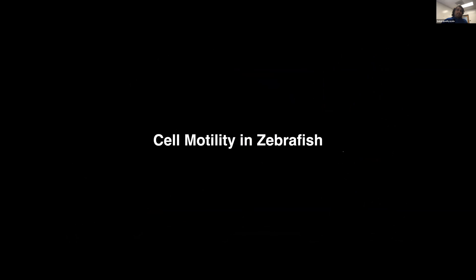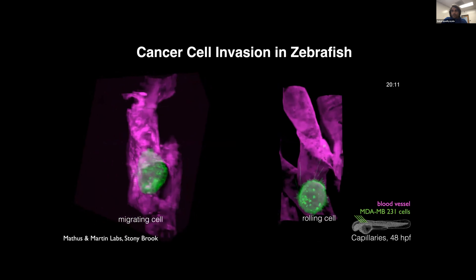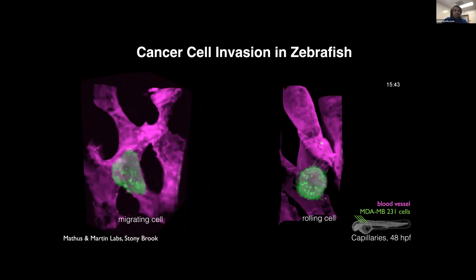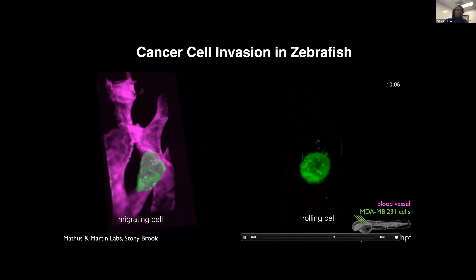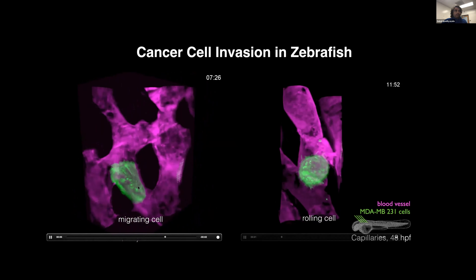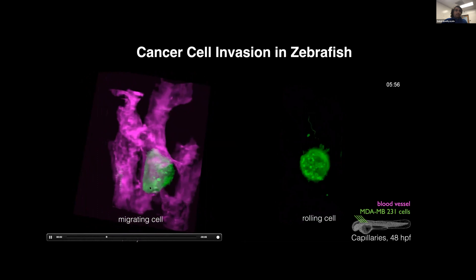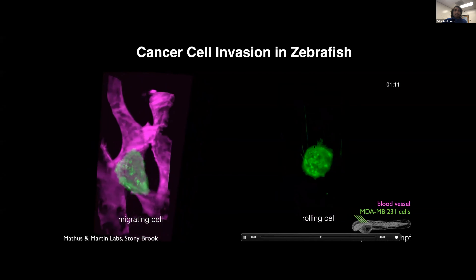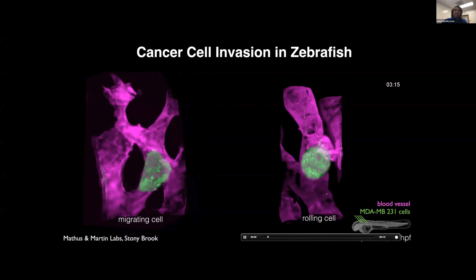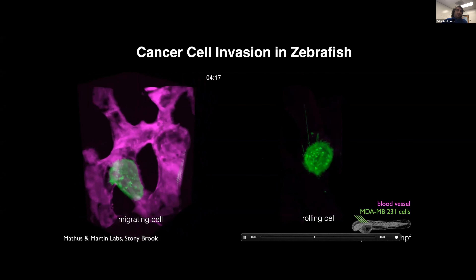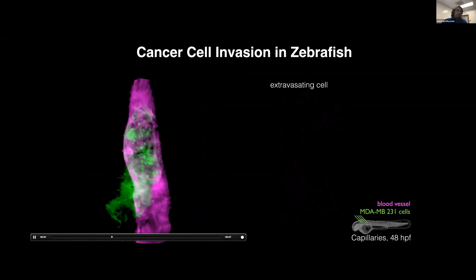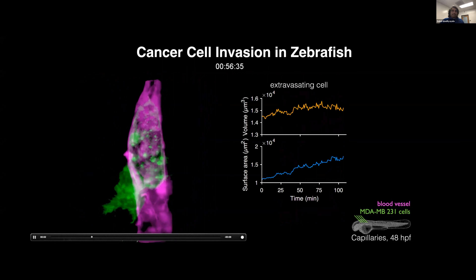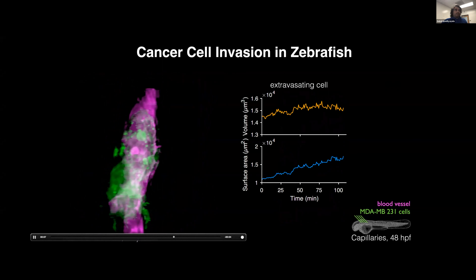For cell motility, we generated a xenograft model injecting human breast cancer cells into zebrafish. The breast cancer cells appear in green; the zebrafish vasculature is labeled in magenta. We observed different migration behaviors: one cell squeezing through narrow vessels and dilating them, another rolling on top of blood vessels with long ciliated-looking structures potentially forming catch bonds. In a third example, a cancer cell attempts to extravasate out of a blood vessel — we know it's trying to metastasize because its surface area increases by about 50% over roughly two hours.